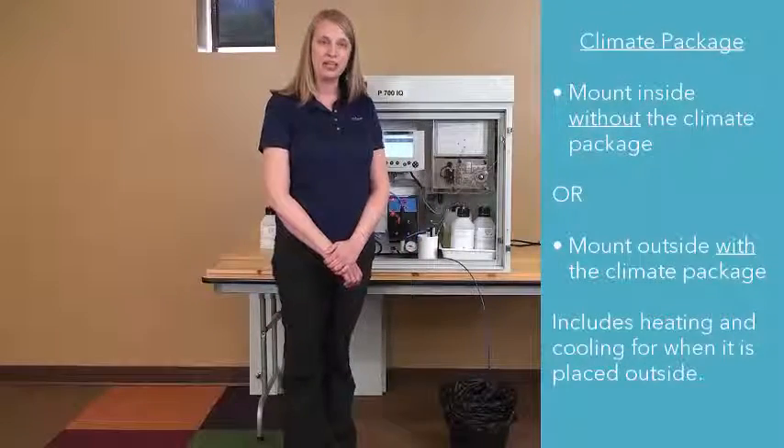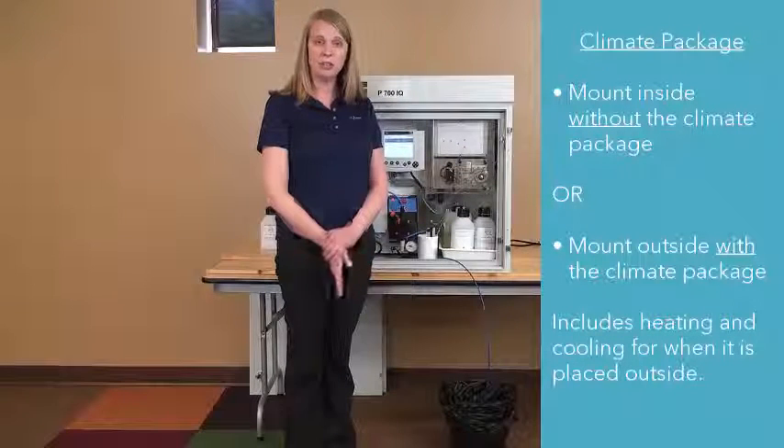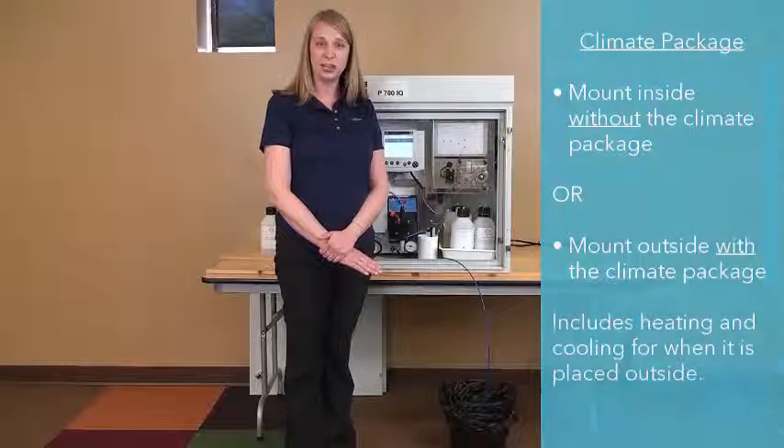You can also get it with or without the climate package that allows you to mount it outdoors. Without the climate package, you can mount it indoors or inside a building.